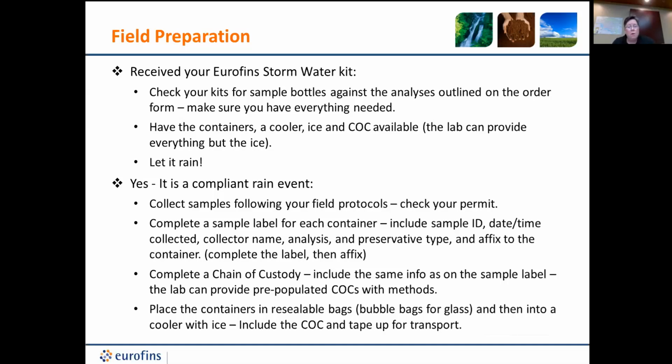Up to a year, as long as the kit is not left like in a garage with gasoline or stored out where it can get damaged, about a year. Anything with a preservative in it, we would say no more than about 6 months. 6 months. Yeah. Thank you.